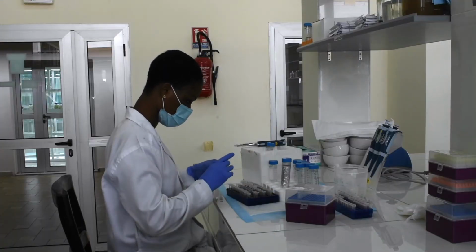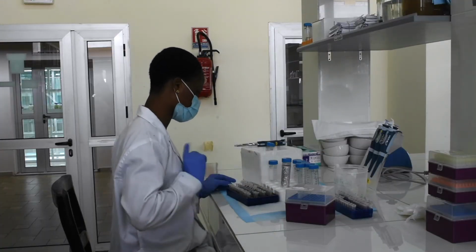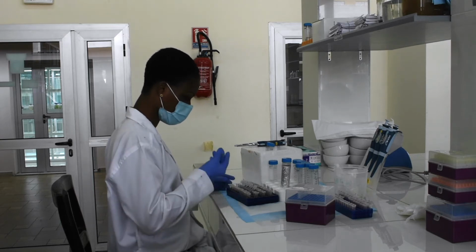The first method that we use here is the PCR method for detection. We amplify the DNA. And also the second one that we use here is reverse transcriptase PCR for detection of RNA, because we do the cDNA. And the third method that we use here is the quantitative PCR, which is real-time PCR, for the amplification also for DNA. And also we can do the quantification RT-PCR also.